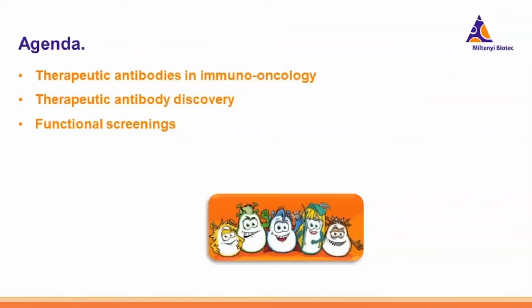So this is the agenda for today. I will first talk a bit about therapeutic antibodies in immuno-oncology in a more general way, just a short introduction into the topic. Then I will talk about the therapeutic antibody process, which steps are involved, and how this actually works until you really get this therapeutic antibody, the final product that goes to the patient. And then we also talk about the functional screening of those antibodies, because this is also a very important step in this whole development process.